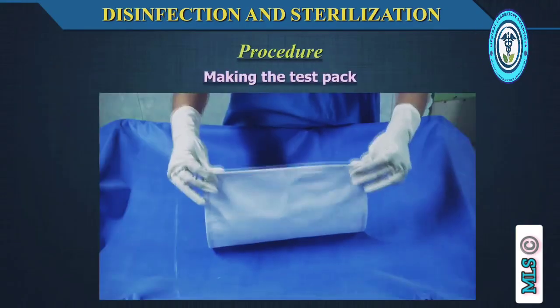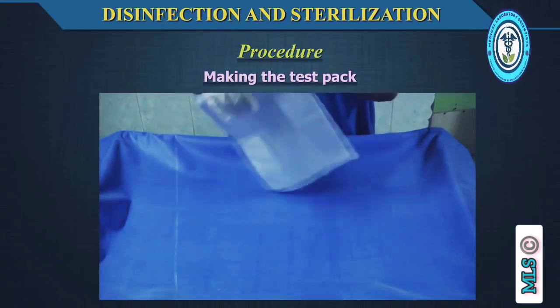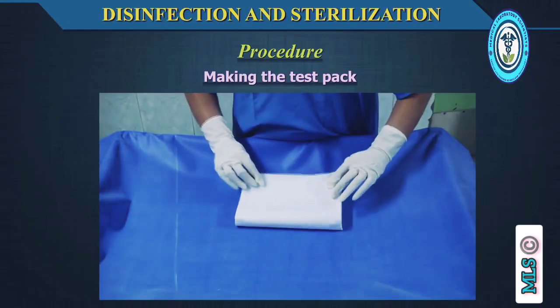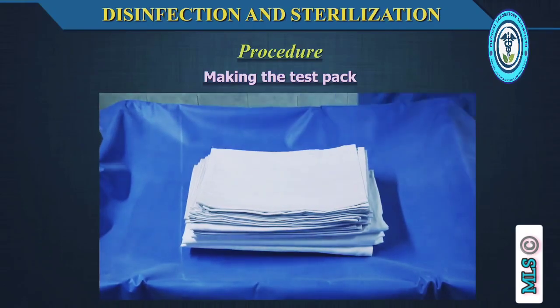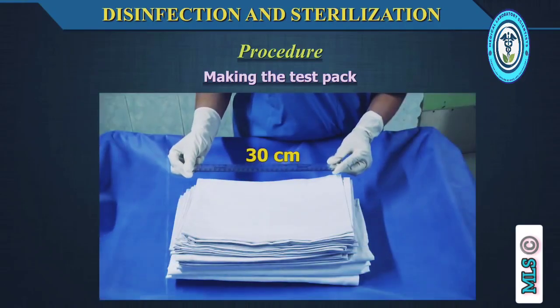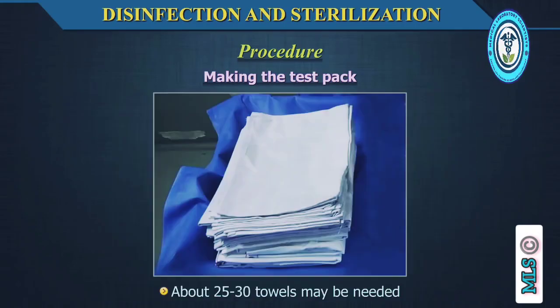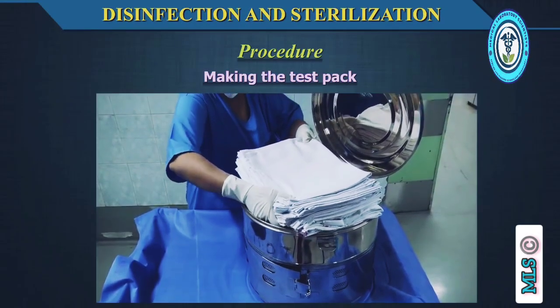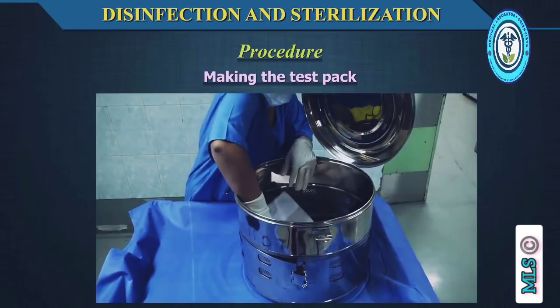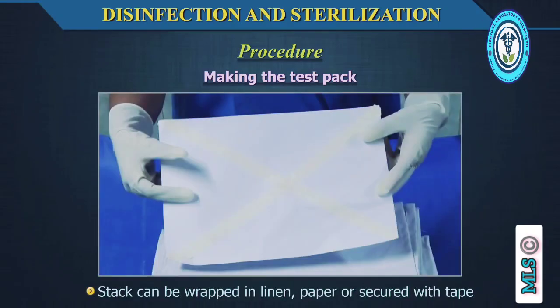Procedure. Making the test pack. Each towel should be folded in half 3 times to provide 8 thicknesses and placed one on top of the other to form a stack of 30 cm by 22 cm by 27 cm. About 25 to 30 towels may be needed. The stack may be placed in a dressing casket or a box made of cardboard or metal which is not airtight. The stack can be wrapped in linen, paper, or secured with tape.